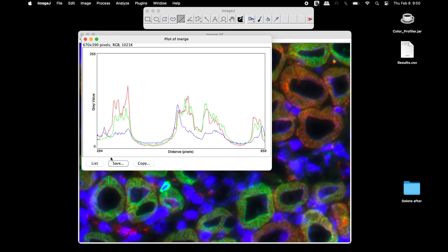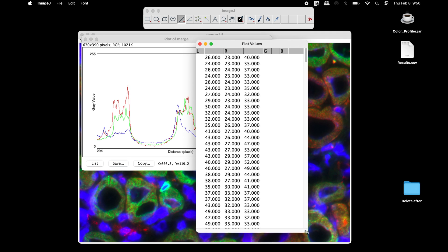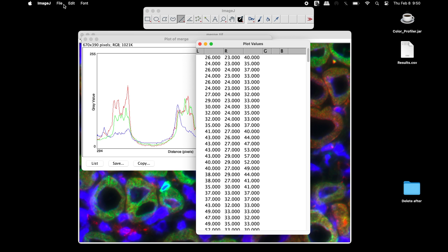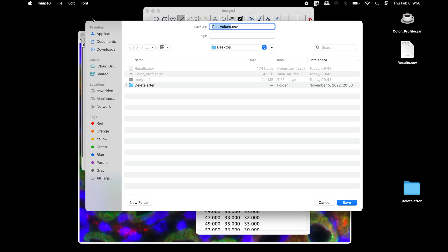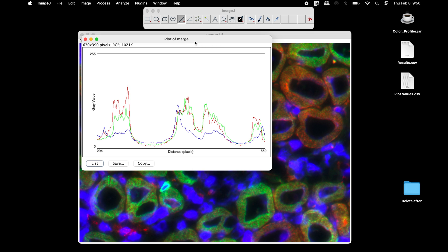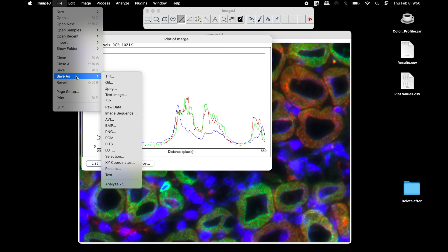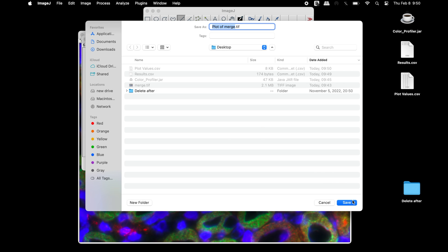Click on the list to find the plot values of each color channel. These plot values can be easily saved in a CSV file. This image plot can also be saved in any format of your choice.